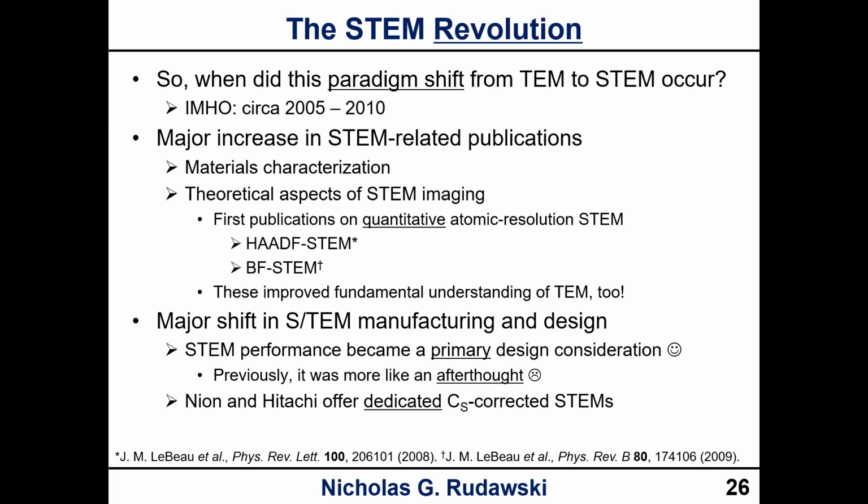Even with the JEOL 2010F, when STEM mode was introduced, it was really an afterthought rather than a primary design consideration. But now with these microscopes, STEM mode is often the primary design consideration, especially now that you have manufacturers that offer dedicated STEMs that only function in STEM mode. Specifically, Nion and Hitachi offer dedicated Cs-corrected STEMs. So this is what I'm terming the STEM revolution.